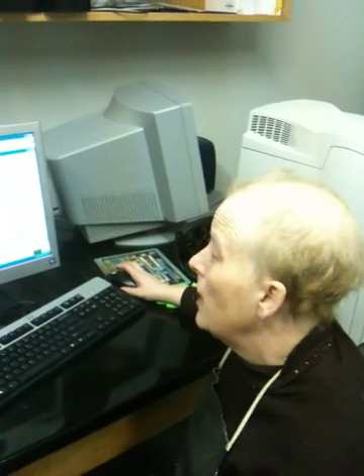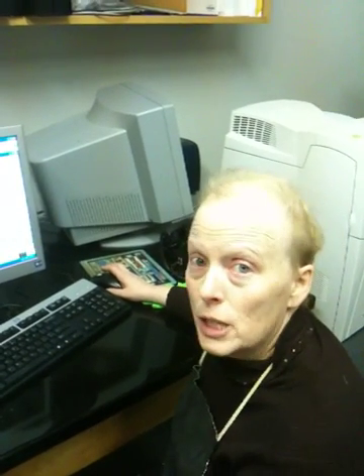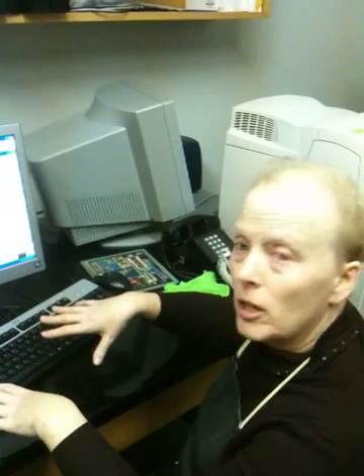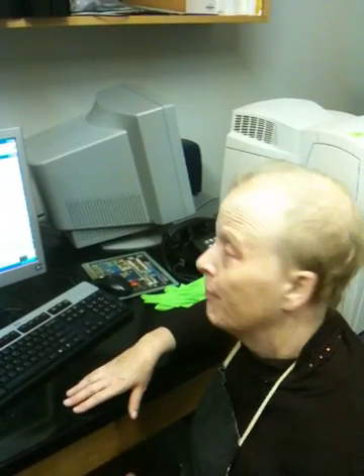So I showed you how to put the sample in. And now what I'm going to do is show you how to run the spectrum. You'll notice I don't have gloves on, I don't have goggles on. You don't really need goggles in here. And you don't want to have gloves on because chemicals on your gloves could dissolve the keyboard.